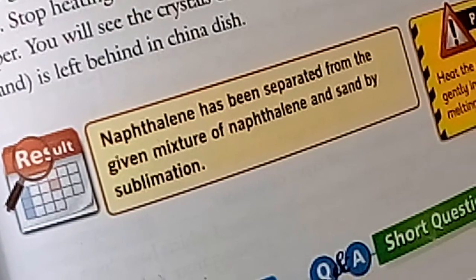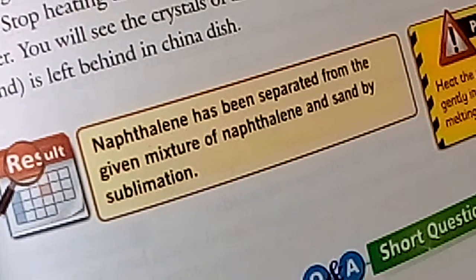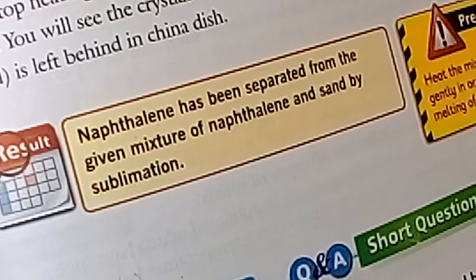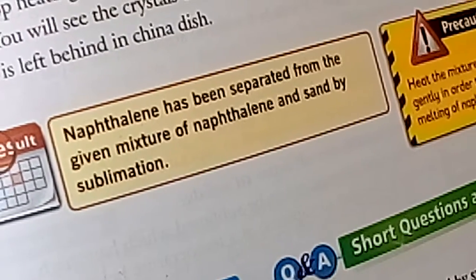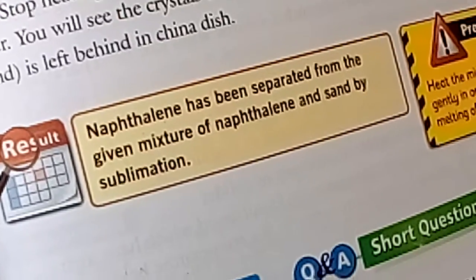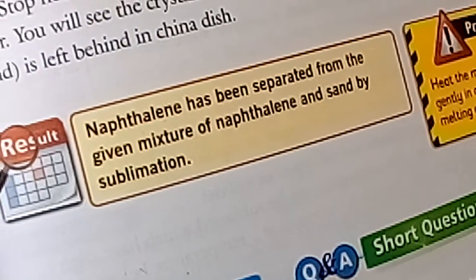We have cleaned the inside of the funnel with tissue paper, and you can see the crystals of naphthalene on the tissue paper as well. Now we will conclude our experiment: naphthalene has been separated from the given mixture of naphthalene and sand by sublimation. Jazaakallahu khairah.